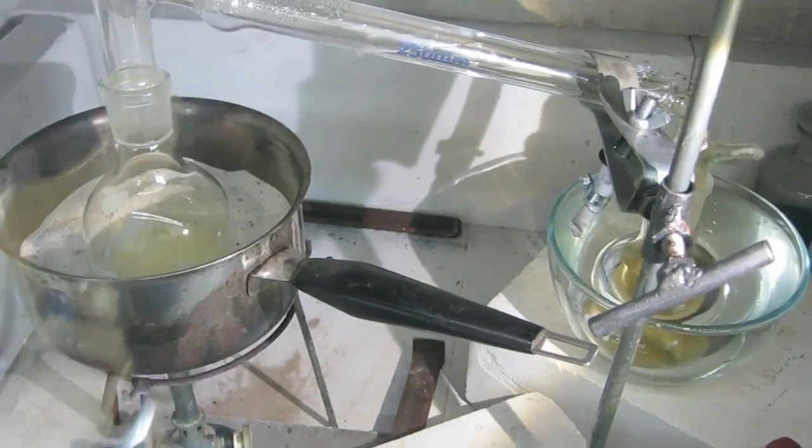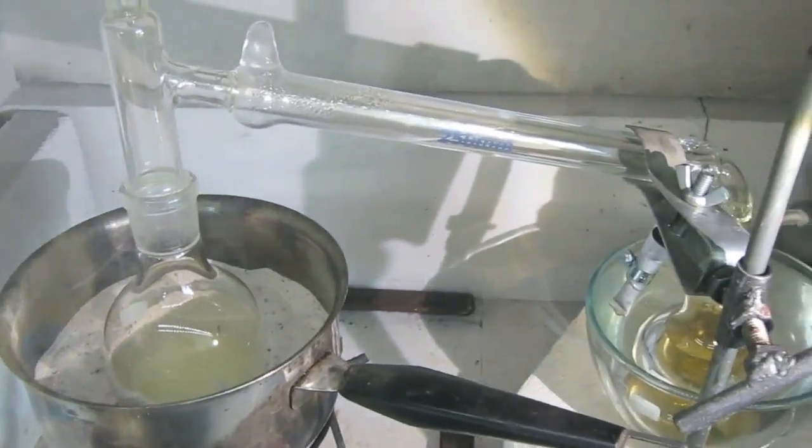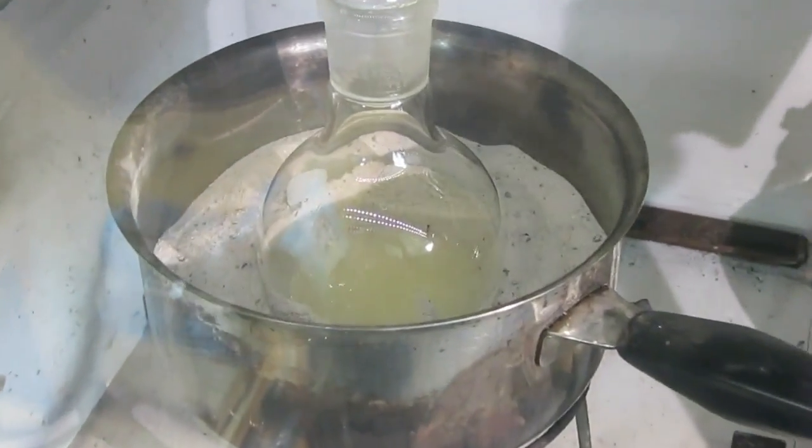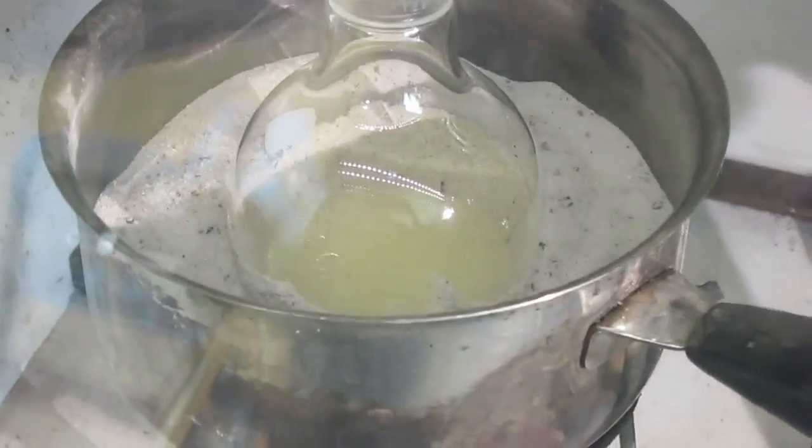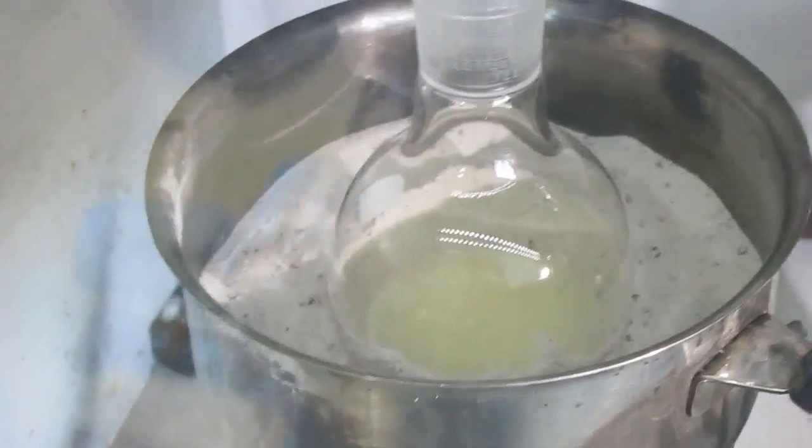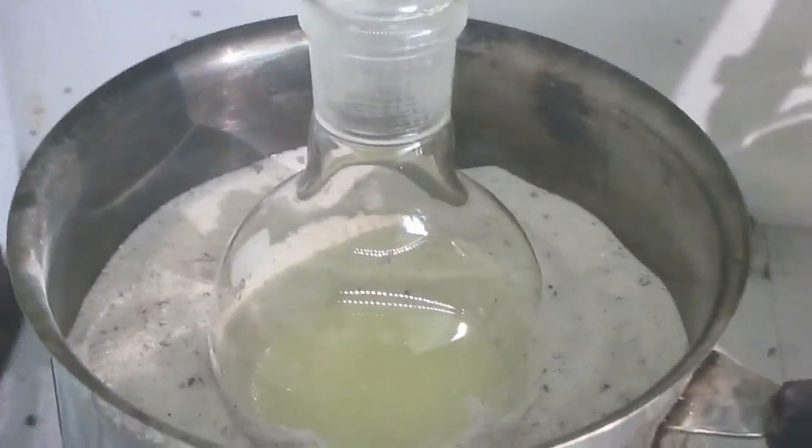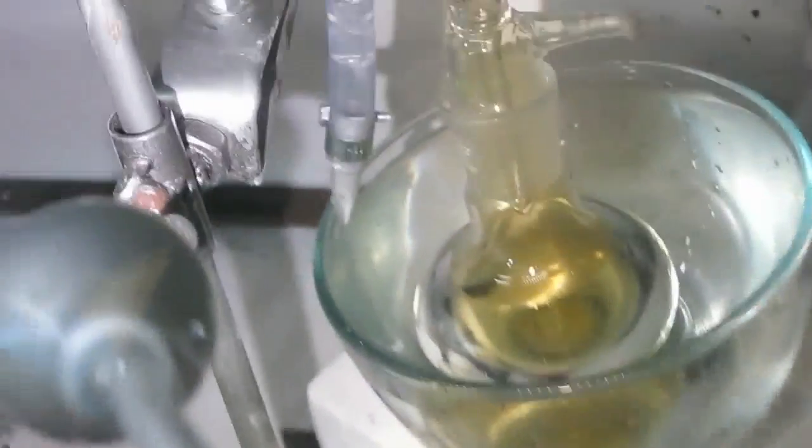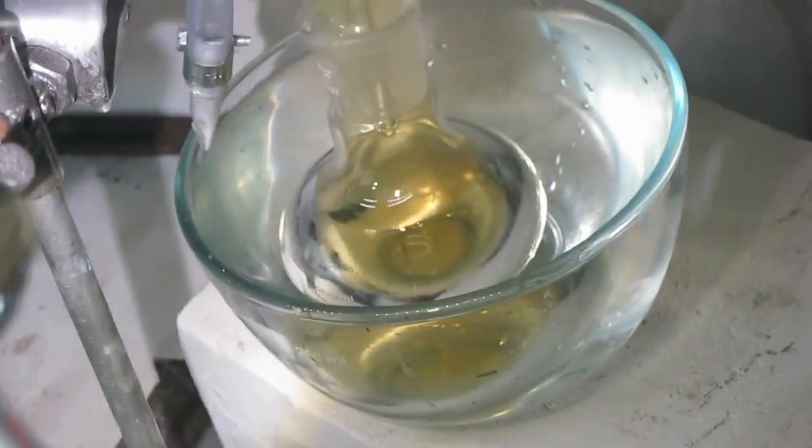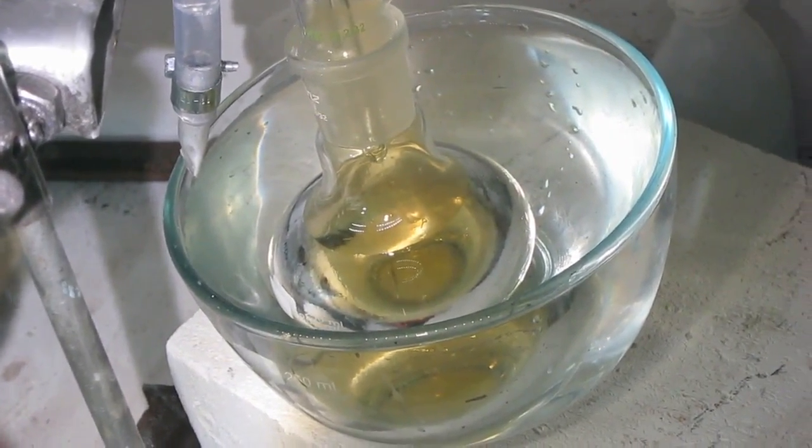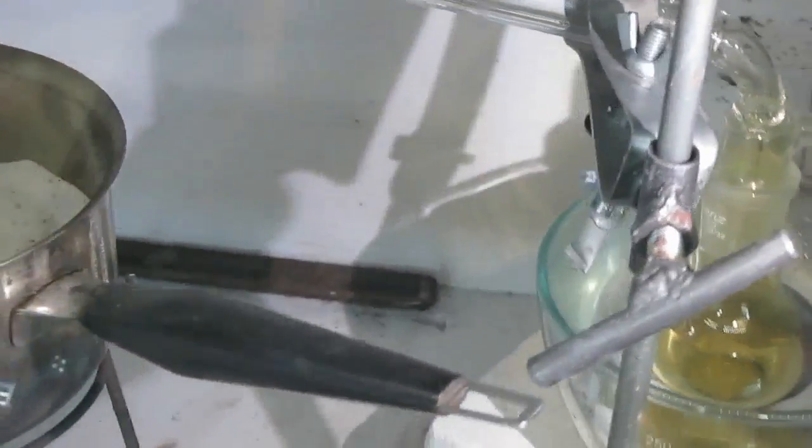Finally, nitric acid distillation works with a sand bath. Herein, you see in the Florence flask that there is some gas escaping from the solution of KNO3 plus H2SO4. And it condenses into the receiving flask. As you see it drips here on the other end. It drips to the other flask. So now it finally works.